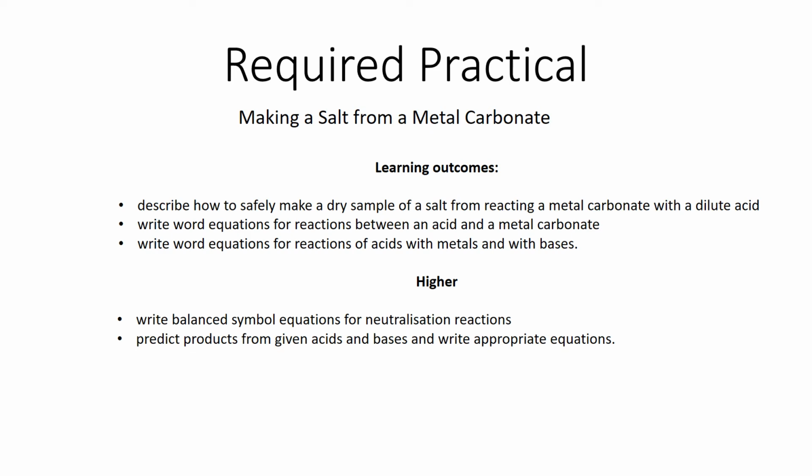Morning Year 10. Today we're looking at another required practical, making a salt from metal carbonate. 5 learning outcomes today. The top 3 are all for the foundation and the higher, whereas the bottom 2 are only just for the higher. And there is a lot of safety that goes into this practical, lots of emphasis on techniques and practical understanding of why we do different things at each stage.